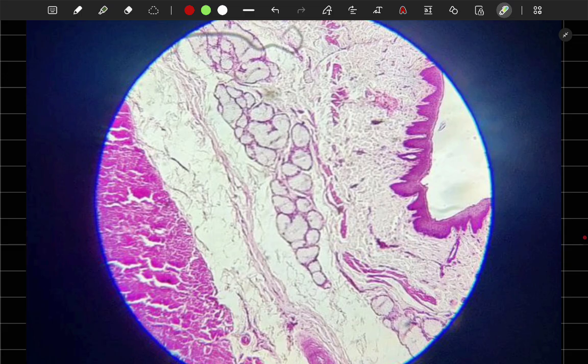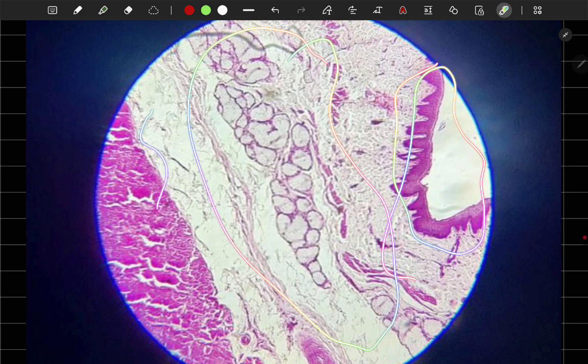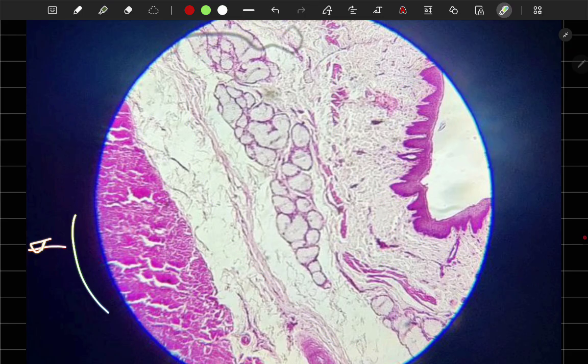So basically now we will discuss this first slide. This slide shows us a luminal structure. Here is the lumen, this is the luminal side, this is the serosal side, and it is a 4-layer structure. This is the mucosa, this is the submucosa, here we can see the muscularis, and if we extend this slide on this side we can see the serosal layer too. This is a non-keratinized lumen, and the epithelium is stratified squamous epithelium, non-keratinized stratified squamous epithelium.